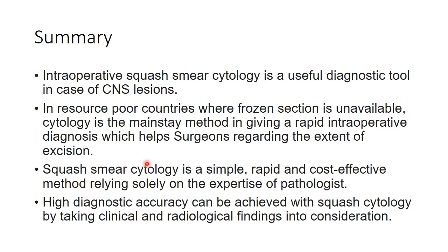Squash smear cytology is a simple, rapid, and cost-effective intraoperative technique, and is totally dependent on the expertise of the pathologist. So a pathologist should train himself or herself to see a squash smear and report it accurately. A high diagnostic accuracy can only be achieved with squash cytology by taking the clinical as well as radiological findings into consideration.